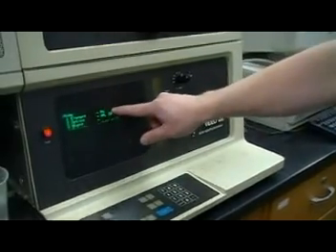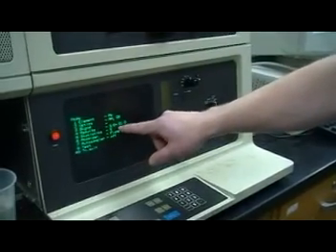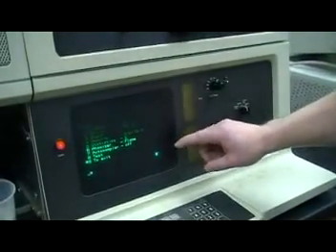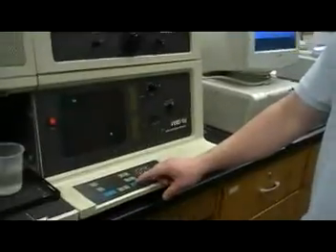And so I have element being lead, and then the optics is atomic absorption, double beam. The statistics, we're going to be collecting five data collections and then averaging. And so this gives us the different information. To get back to the main screen, you can hit enter.